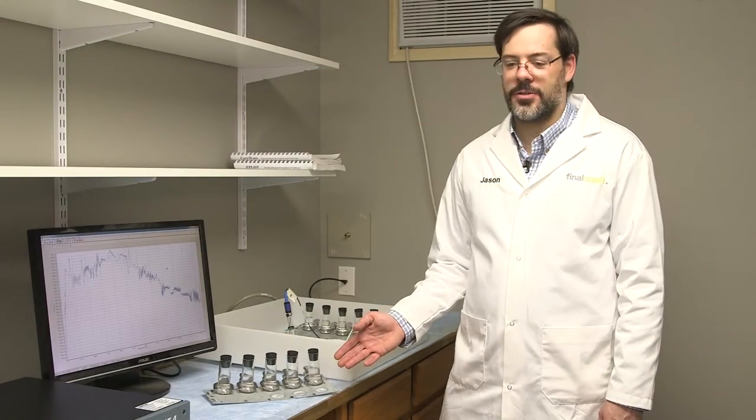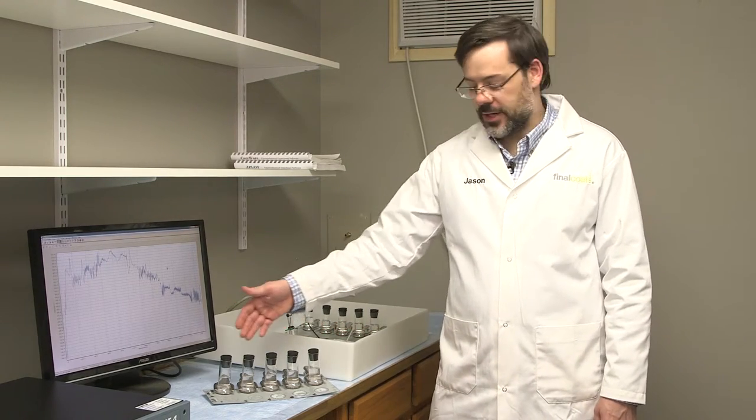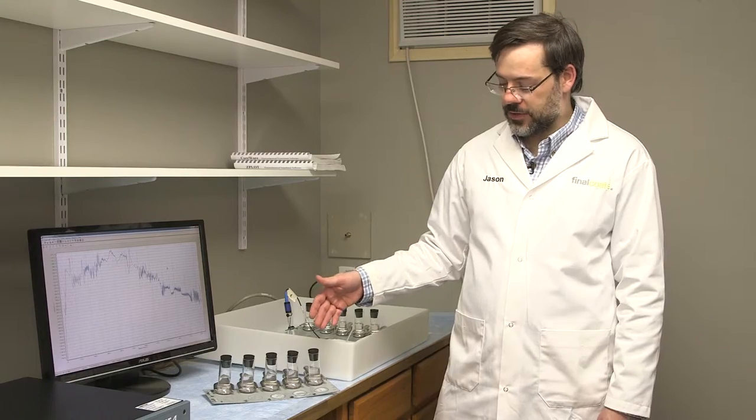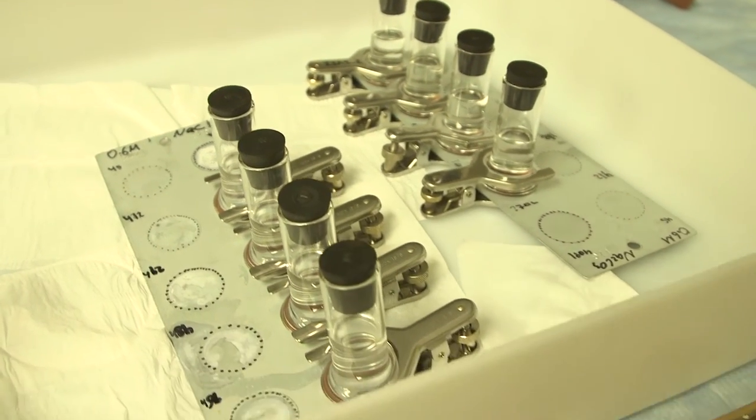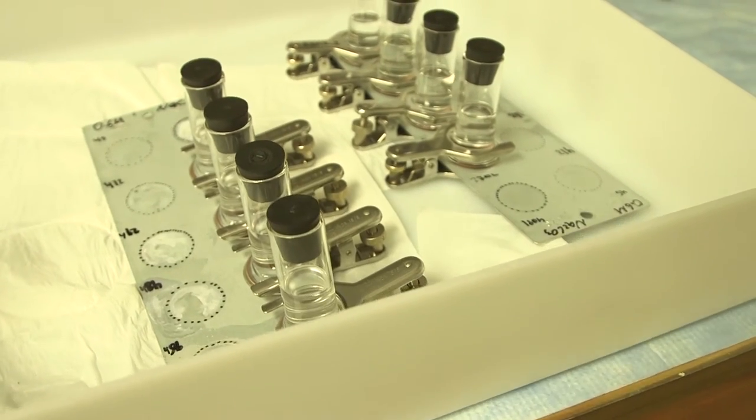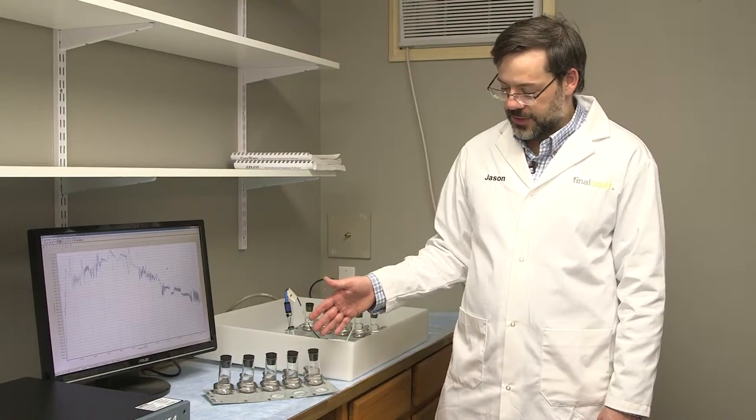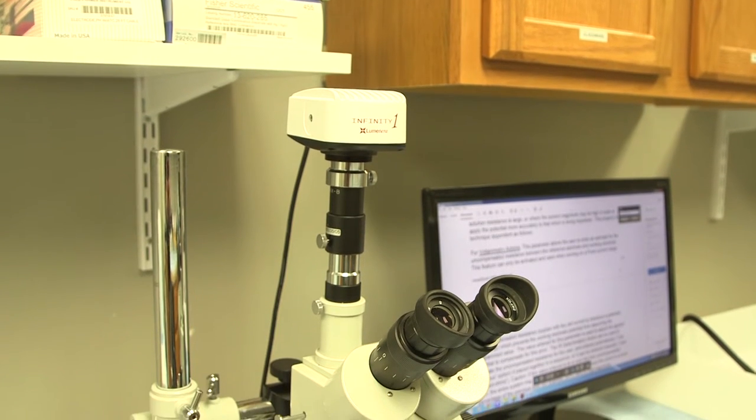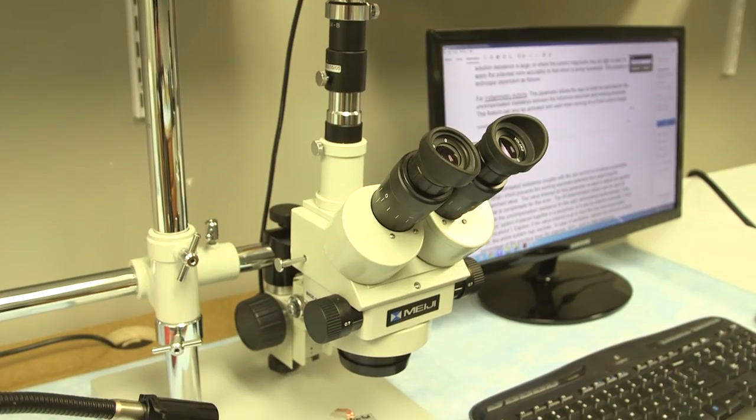This is an experiment we call surface evolution. What that entails, as you can see, is a battery of cells here that are filled with electrolyte in two rows. One row is exposed to an aggressive electrolyte, and another row is exposed to a non-aggressive electrolyte. After a certain amount of time, these are given a visual examination with a CCD camera on a microscope for documentation.